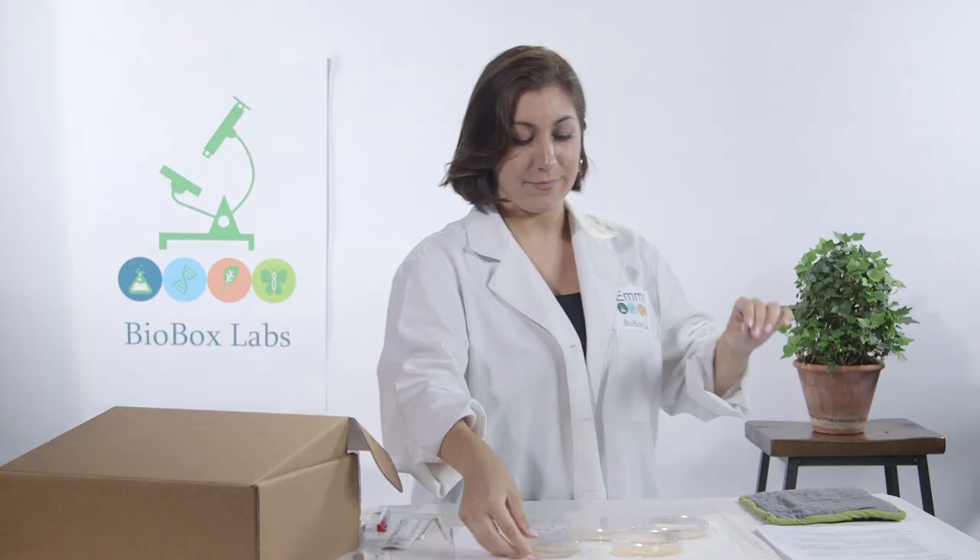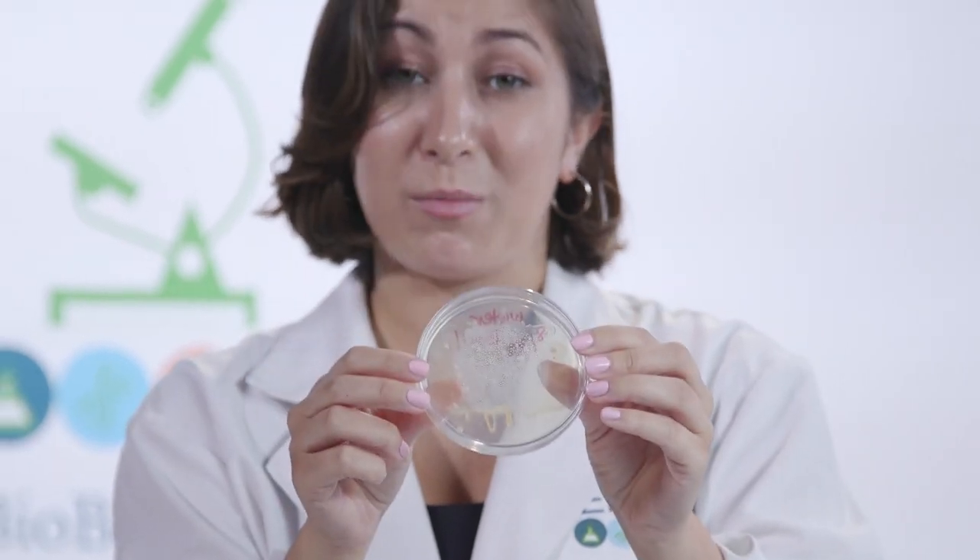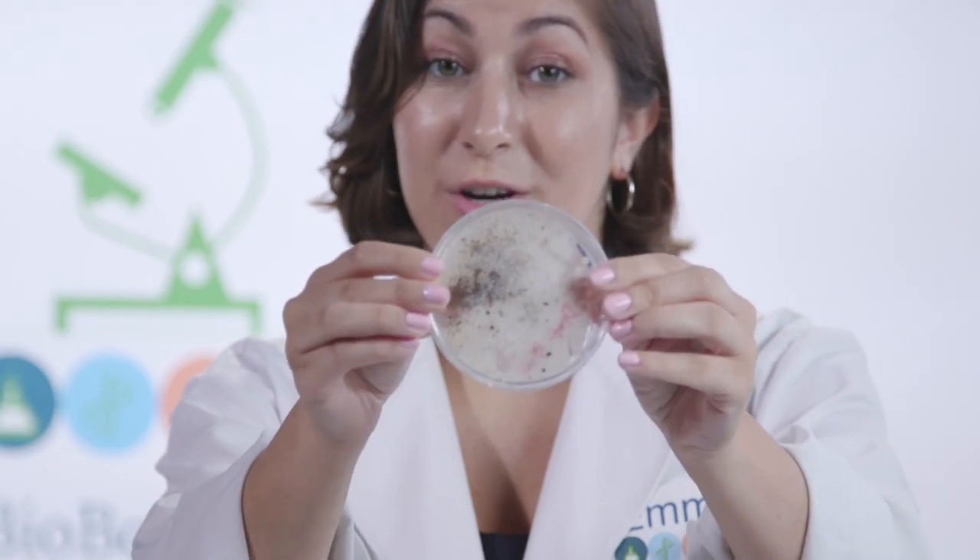Hey guys, so it's three days later — let's check out our zoos. When checking out your zoo, it's important not to open it; we just don't want the germs to spread. So this is my air zoo, and as you can see, the fungus is pretty fuzzy, and most of the other germs have formed colonies in different shapes and sizes. This one is my dog's water bowl — there are some yellow dots in there. This one is dirt, pretty dirty. And this one is my fingernails — that's not good. Now this one is my teeth, and as you can see, there's not much in there, which means I brush my teeth fairly well.